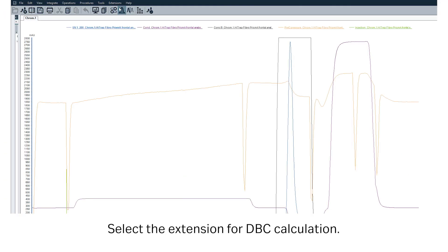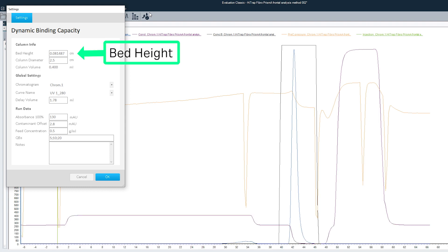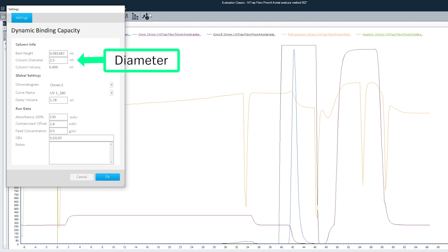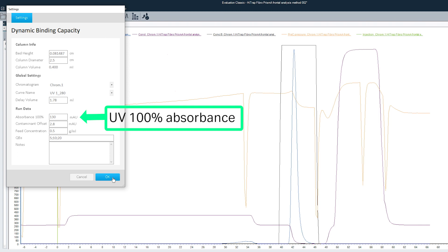Use the Unicorn extension to evaluate the dynamic binding capacity at different breakthrough levels of the target monoclonal antibody. When filling in the parameters, you need to enter a bed height and a diameter. For the HITRAP Fibro Prisma unit, enter the values displayed on screen.